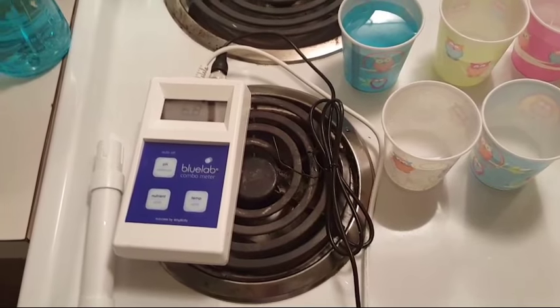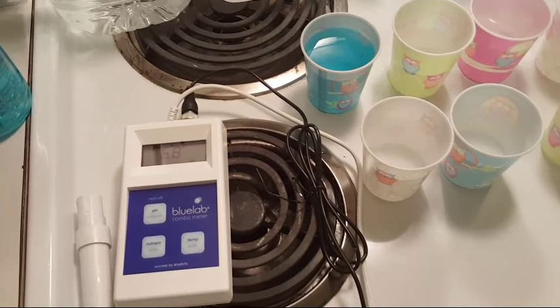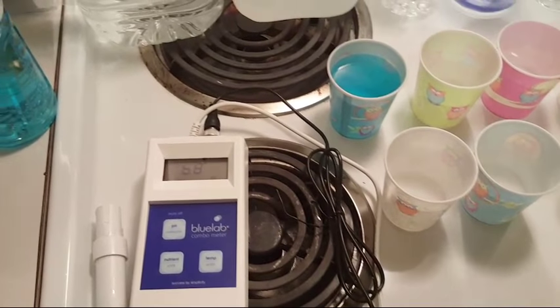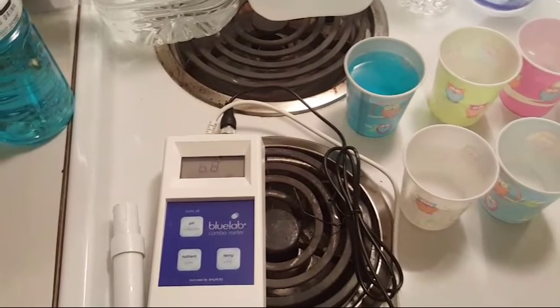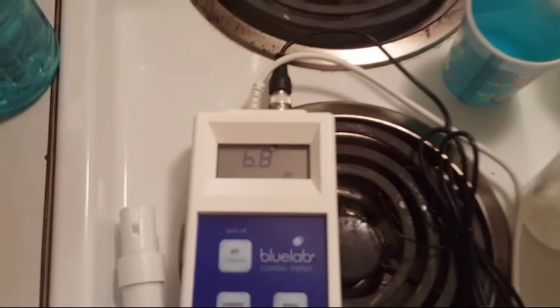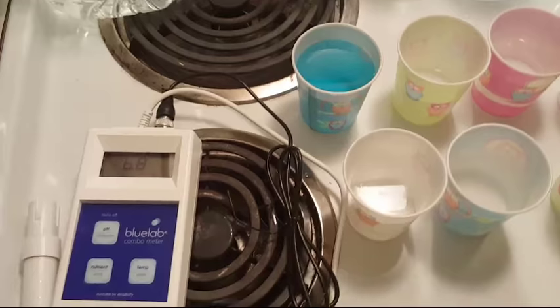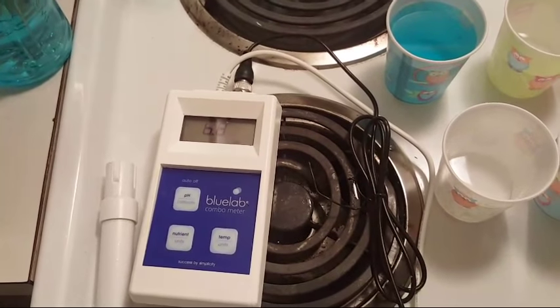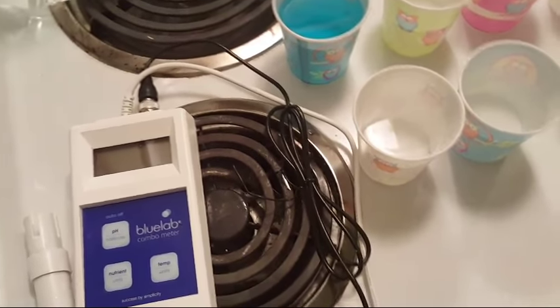When you first run tap water out of your spigot it can be lower in pH, but if you leave it in an open container overnight and test the next day it's actually risen a bit. You can see the Smart Water is already dropping — 6.8 — and it actually goes lower than that. So Smart Water is not the best water as far as pH goes.